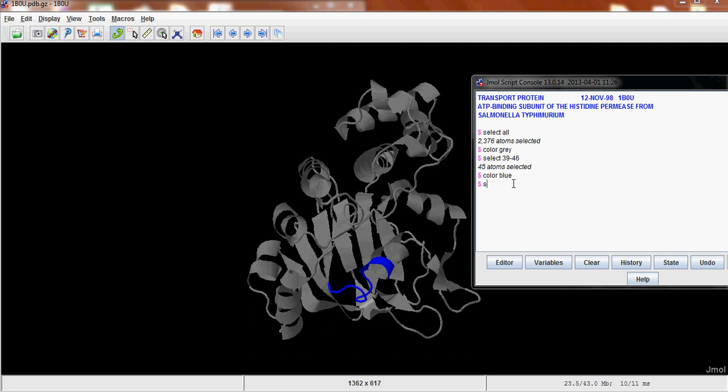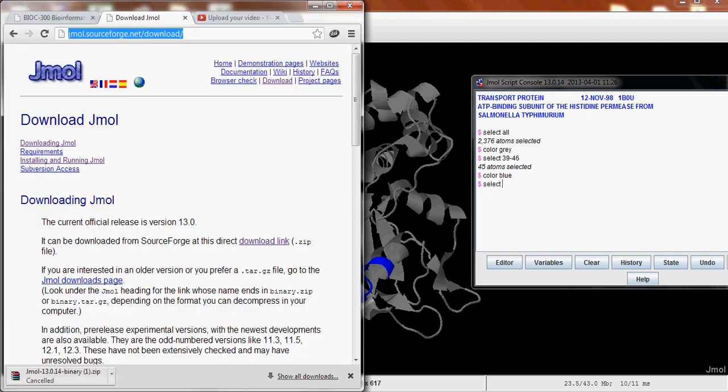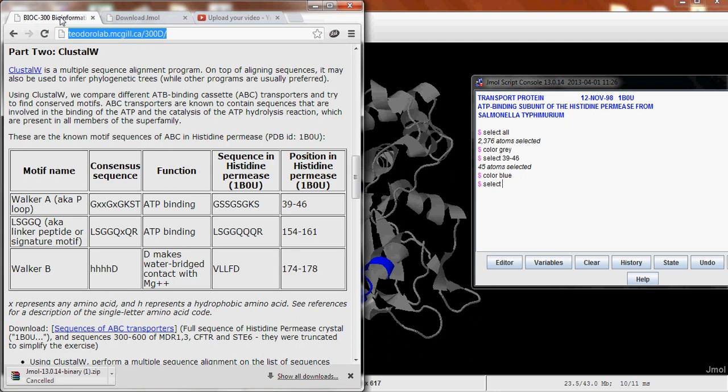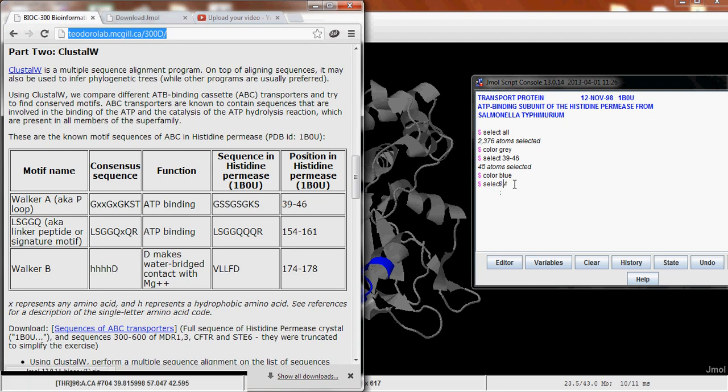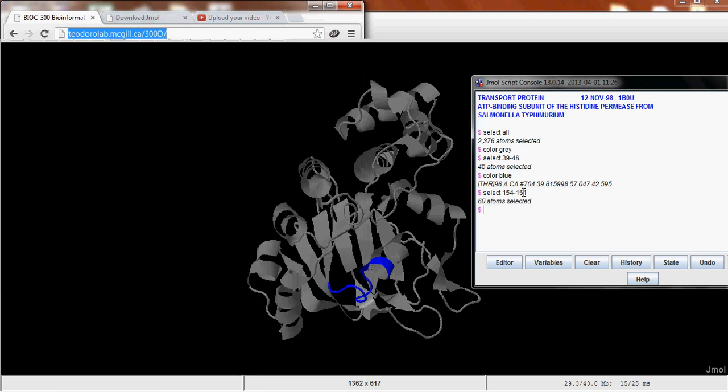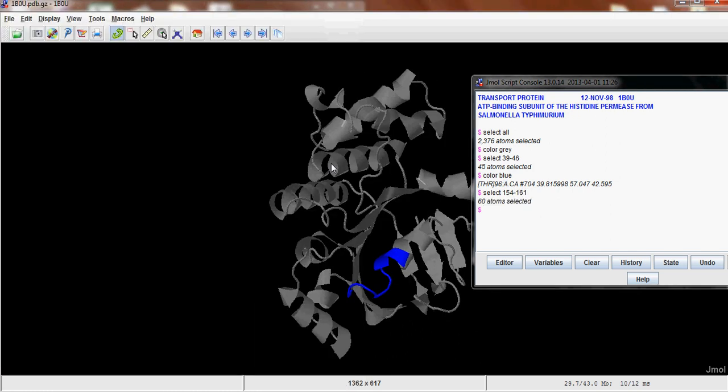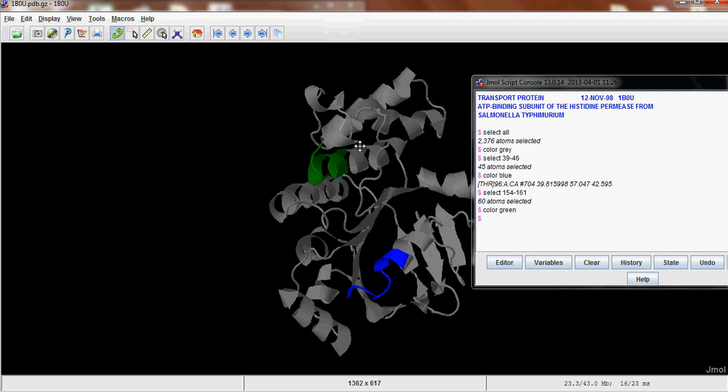And then you can select the other parts. So if you look here, it's 154 to 161. So select 154 to 161. And we're going to color that green. So that shows up as well.